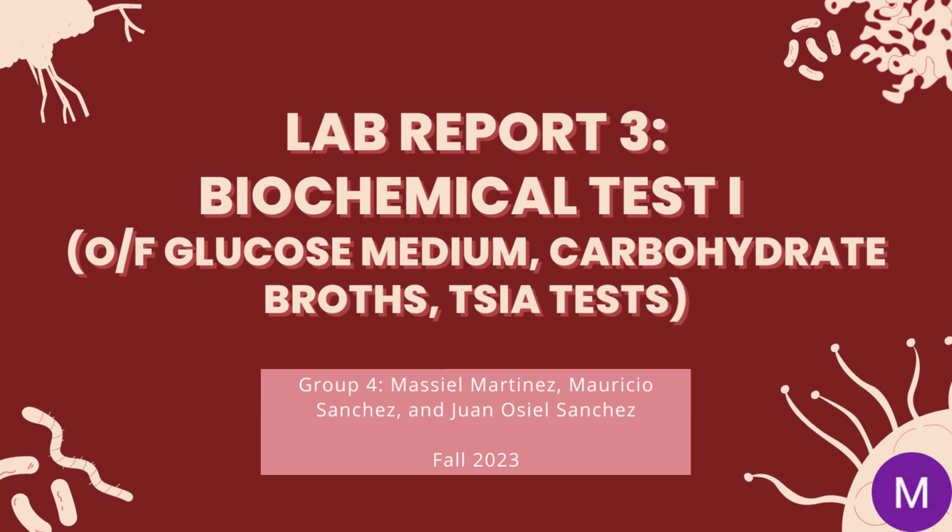This is our lab report number 3. It will be based on biochemical test part 1, which includes OF glucose medium, carbohydrate broth, and triple sugar iron agar test. This will be presented by Massiel Martinez, Mauricio Sanchez, and Juan Sanchez.